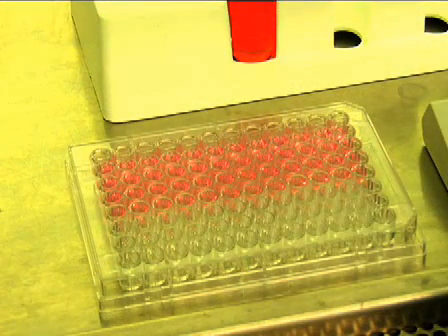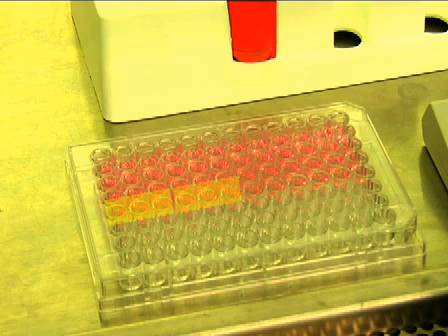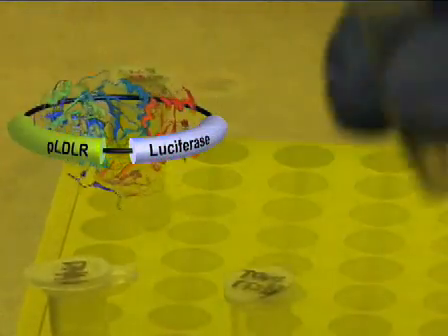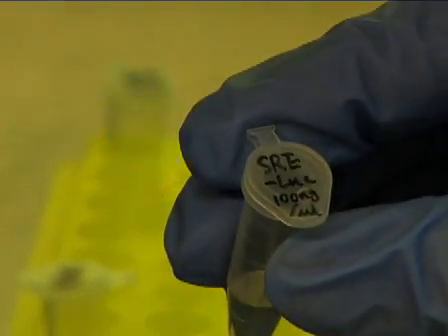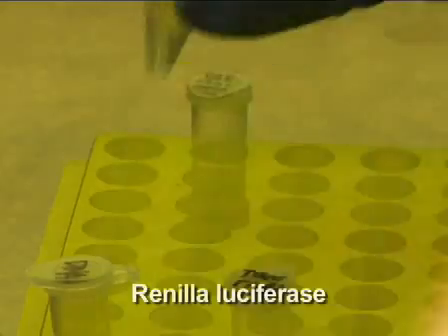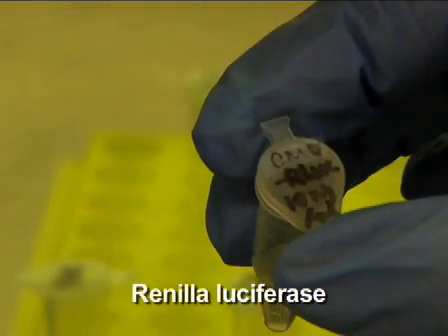For our transfections, we routinely perform all conditions in triplicate and transfect a total of 50 to 100 nanograms of plasmid DNA per well. Plasmid mixes should include at least a reporter construct expressing firefly luciferase and a control plasmid expressing renilla luciferase from a constitutive promoter.